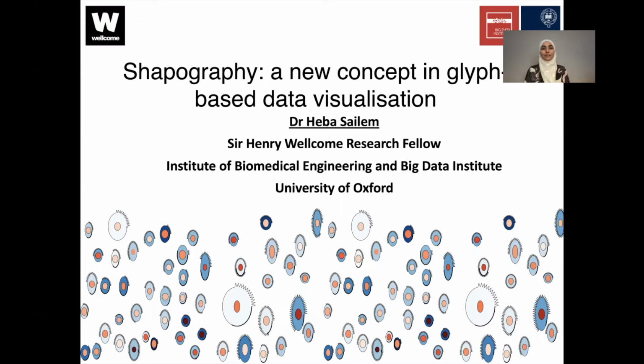I am Heba Sailem and I'm a research fellow at the University of Oxford. My research focuses on studying and analyzing large-scale microscopy data. So today I will talk about ShapoGraphy, a new tool that we created that not only allows the users to visualize their data, but also to create their own visual encoding by a flexible glyph-based approach. It can be applied to any data type, but I will focus on using ShapoGraphy for microscopy data.